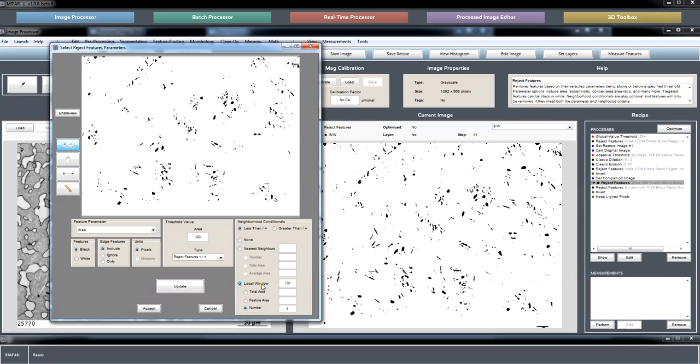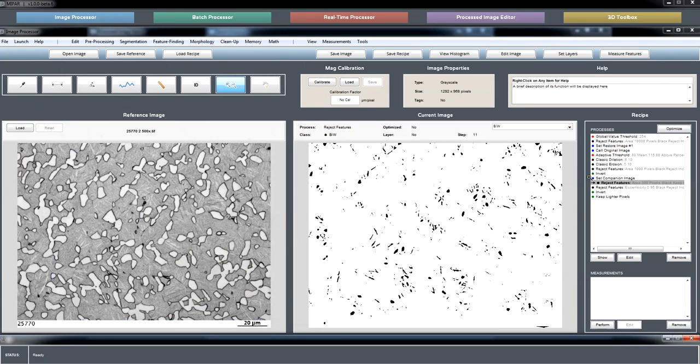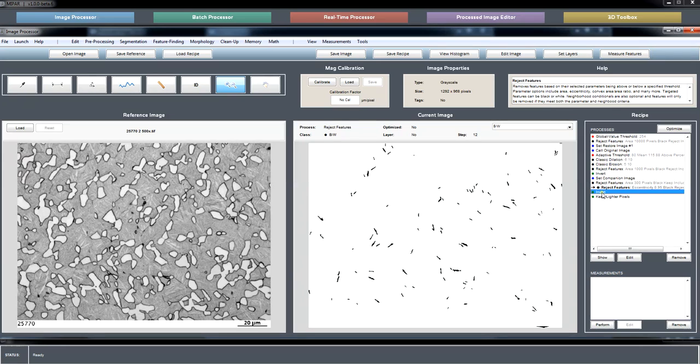And you can, of course, use all kinds of different variables. So let your imagination run and see how these can help you. If 5 nearest neighbors have a total area of under this value, there are all kinds of different operations that you can achieve with neighborhood conditionals like that. Hopefully that was helpful. So we're moving on.